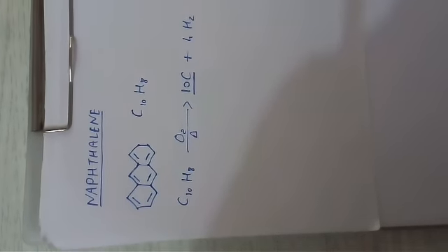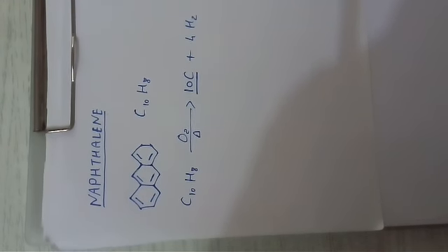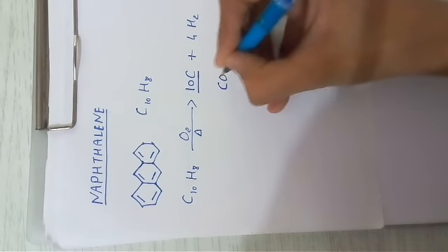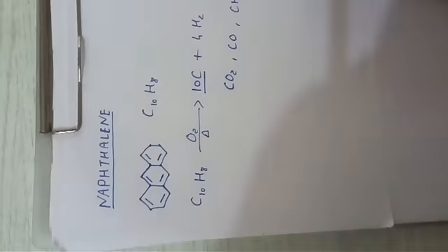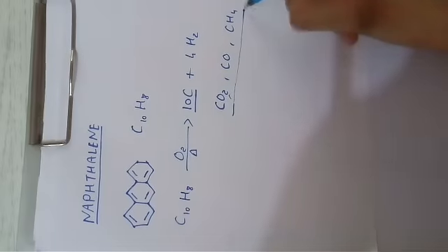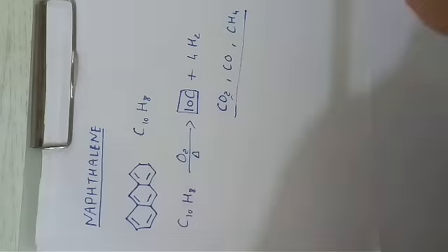So we're gonna have a fire extinguisher on hand, because it's a very dangerous experiment, and do this experiment always outside, as it will produce lots of gases such as carbon dioxide, carbon monoxide, and some methane. These are the main gases which will form. So do this experiment outside, and we're gonna have the carbon in hand. Okay, so let's go outside.